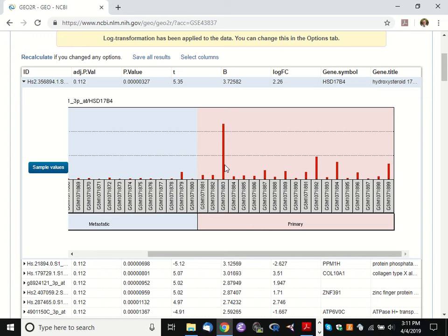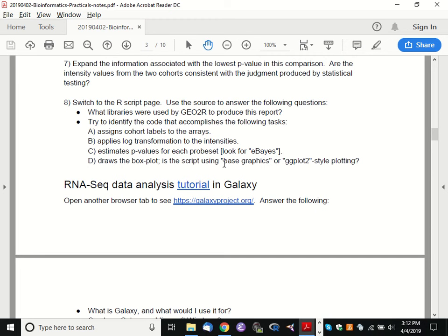It's kind of a mouthful. The MWM is not the most articulate of names. Okay, so we had some alternatives, but the software was designed to just apply t-test in this case. It might be that we could rescue our results if we used a test that was more suited to the variability in this study.